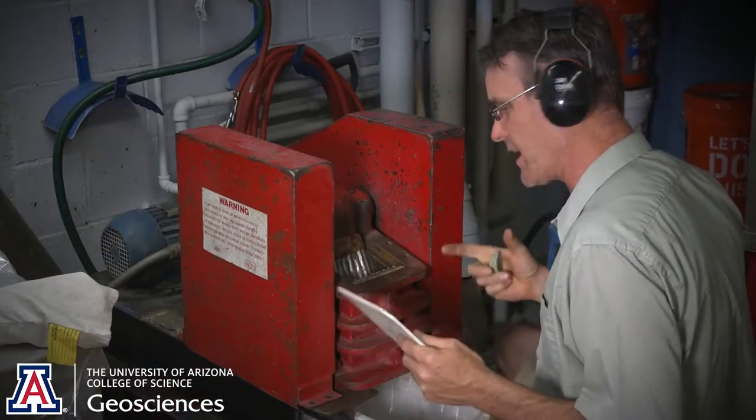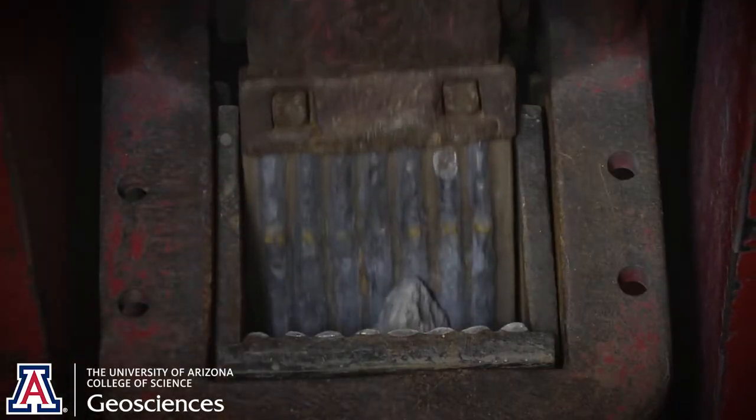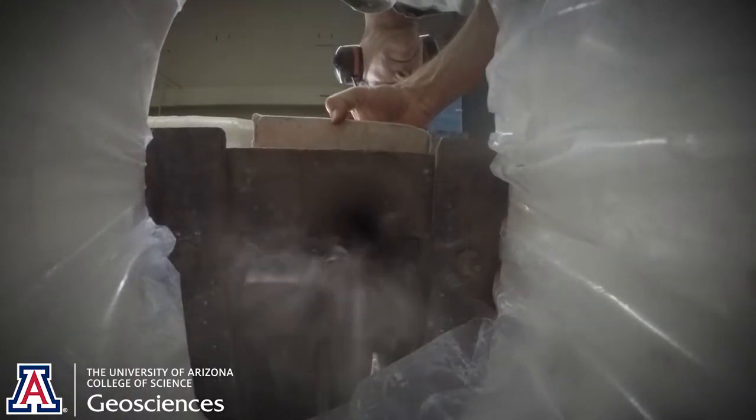I'm Martin Pepper. I do everything in this lab from processing rocks to running samples on the NU and the E2. The first thing we have to do with this is crush it down into gravel. The jaw crusher gets its name because it has flanges of jaws and it quickly nibbles the sample down into gravel.